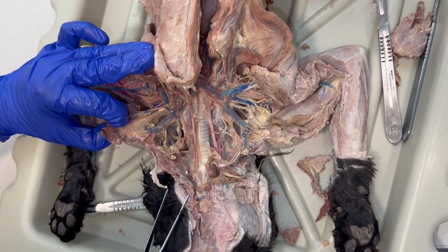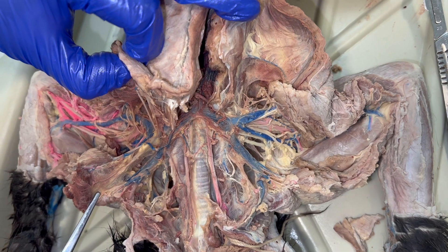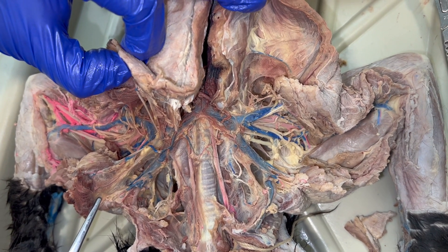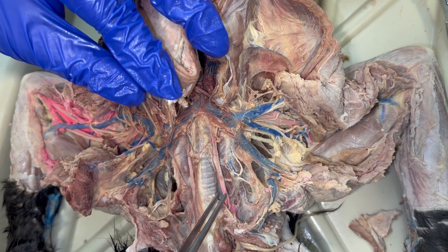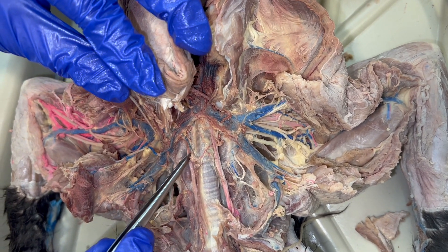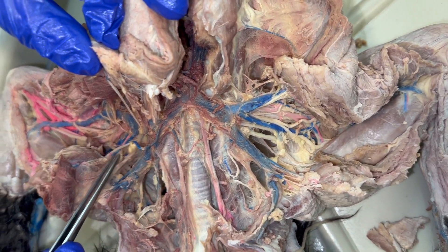Once you have dissected and seen the veins, another step is to dissect and follow the arteries. The arteries are going to be deeper than the veins, so we want to be able to follow and see the branching pattern with those arteries.